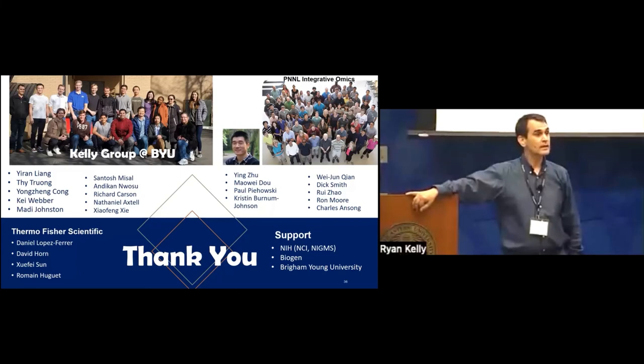Like just testing on bulk. Especially with aliquoted data. Yeah, I think there's a lot of value. We went through all these exercises with conventional bulk DIA data. So there is, but I'm not sure how that would translate to testing single cell data. Right. It would be interesting to think about that.